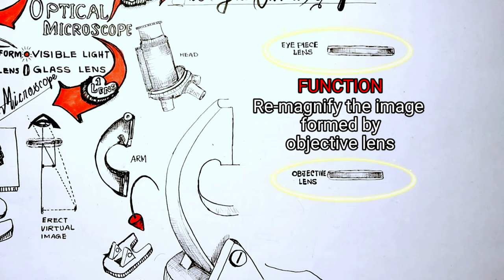The final image formed by the eyepiece lens will be a virtual, erect and magnified one.